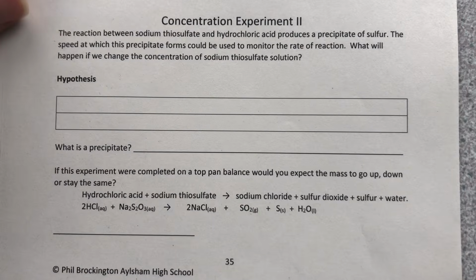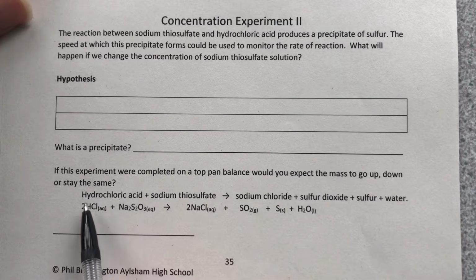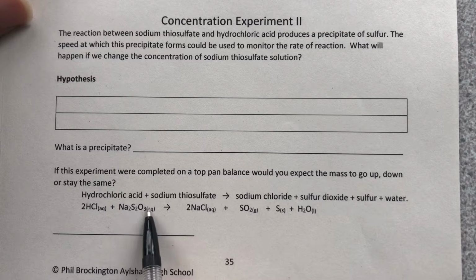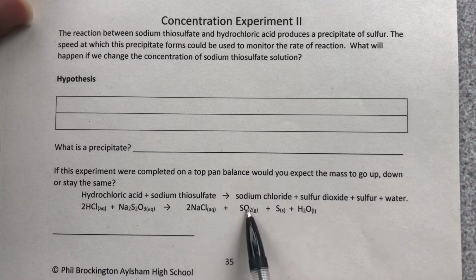So in this video we're going to look at our second core practical around rate of reaction. Now this video involves a reaction between hydrochloric acid and sodium thiosulfate. Hydrochloric acid has the formula HCl and sodium thiosulfate has the formula Na2S2O3. Now when these two substances react together they make four products: sodium chloride, sulfur dioxide, sulfur and water.